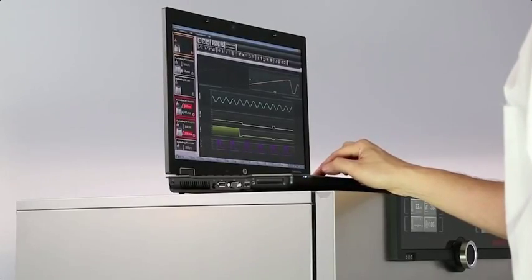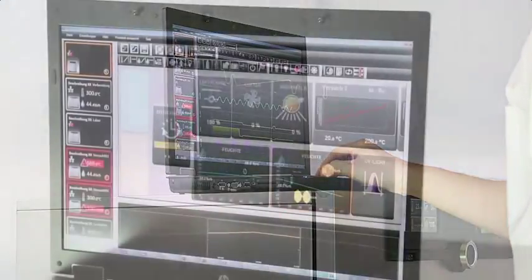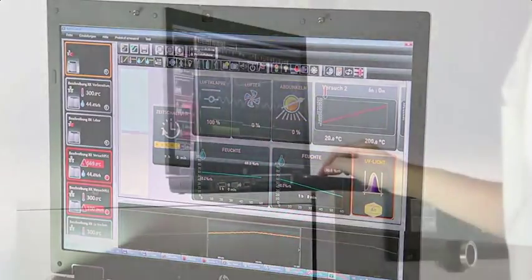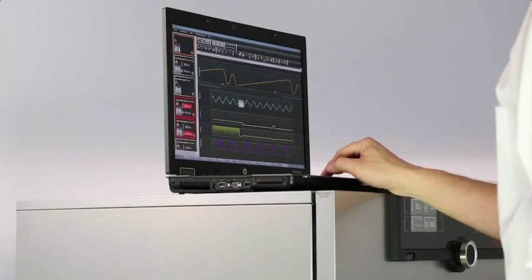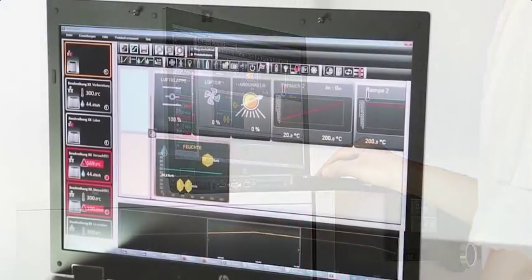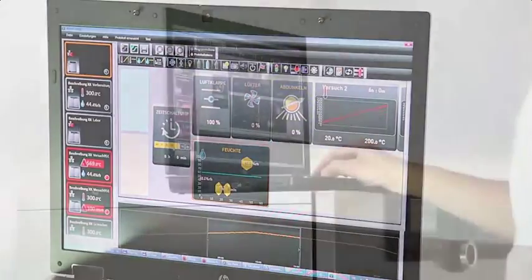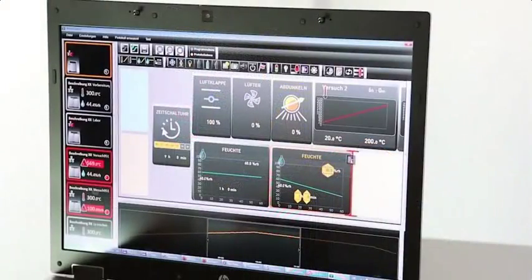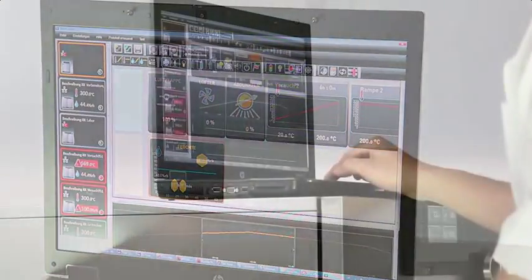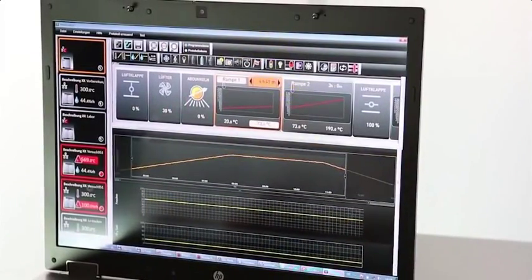Quick and easy operation, maximum comfort — that's the motto of Generation 2012 appliances. It is also true for the control and logging software Atmo Control, which features a completely new and intuitive interface. Simply use the mouse or touchpad to drag and drop the graphic symbols for the desired profile onto the interface. Numerical and graphical programming of complex processes is a thing of the past — with just one click you can change the parameter settings.